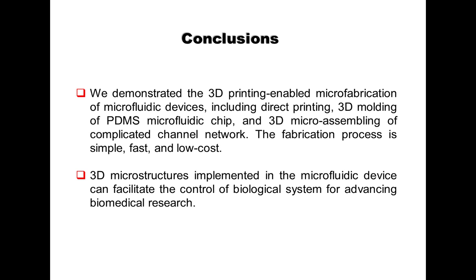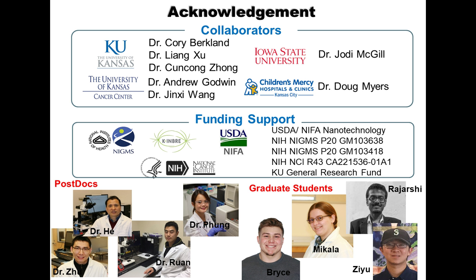And the fabrication process is simple, fast, and low cost. And the 3D microstructures implemented into the microdevice have facilitated the control of the biological system for advancing biomedical research.